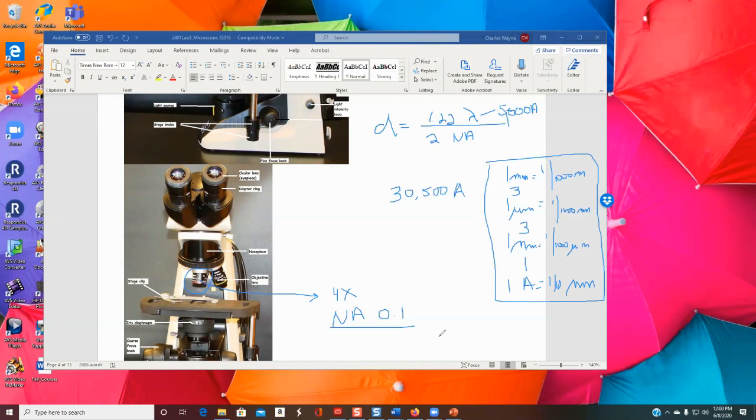Okay, and I'll say them again one more time. 1 millimeter equals 1/1000th of a meter. 1 micrometer equals 1/1000th of a millimeter. 1 nanometer equals 1/1000th of a micrometer. And 1 angstrom is 1/10 of a nanometer. So you can go back and write it better if you don't like the way it looks. And even if I write it without this mouse, everyone still has that problem. So I verbally did it.